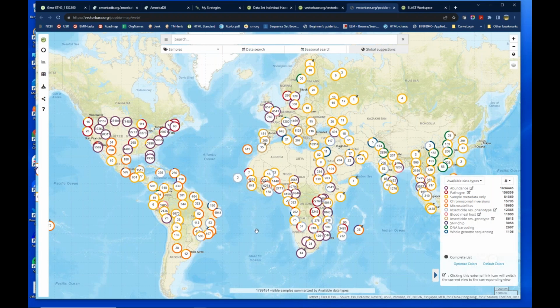I think that's all I wanted to show. I wonder if there are any questions. I don't see any questions in here, but Stephen, who's on the call, sent an email to the helpline, which I saw, about the order of the samples and the infection time points in the Cell by Gene app. And he's right. The order is weird.